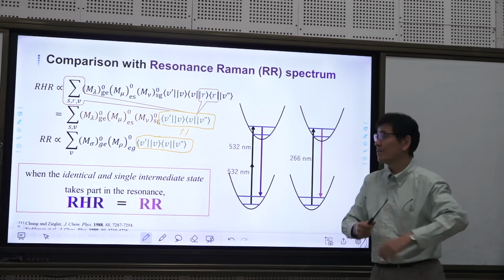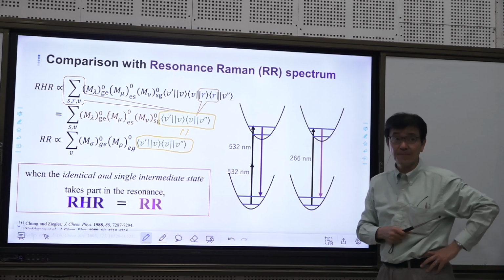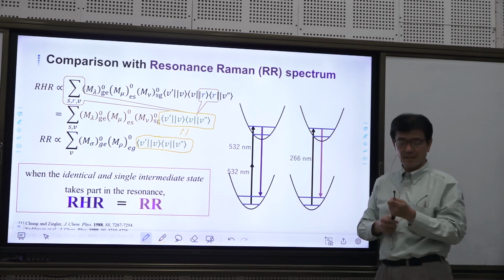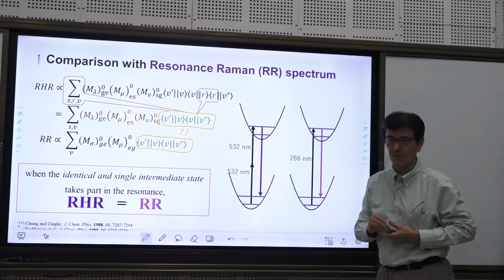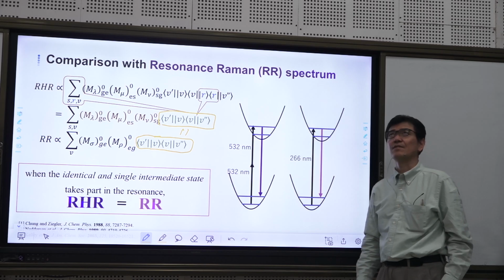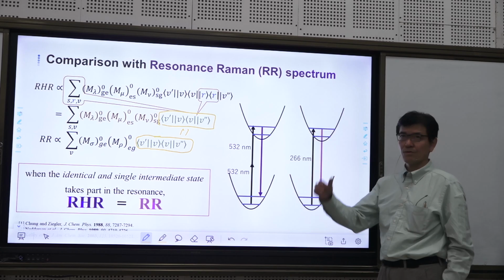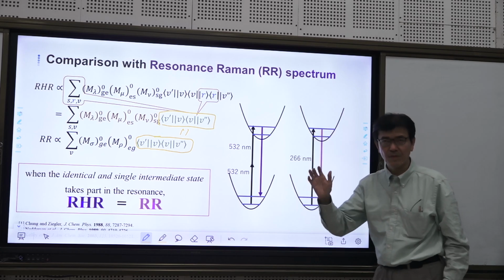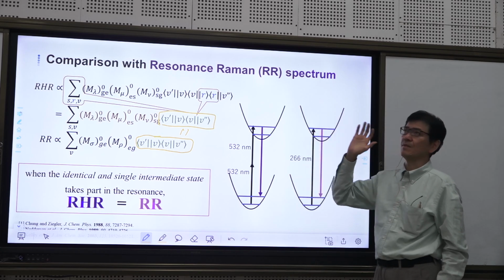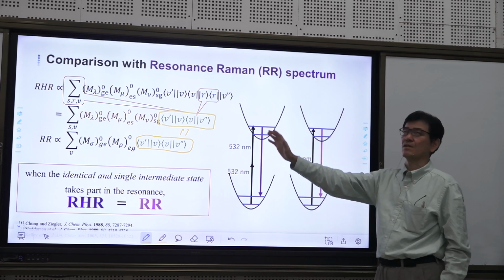Okay, so this is not good news for us. First, we expected hyper-Raman spectroscopy must be new, and I tried to find some new information. But in the case of non-resonance hyper-Raman spectrum, there is no very marked novelty with the result of amino acid.